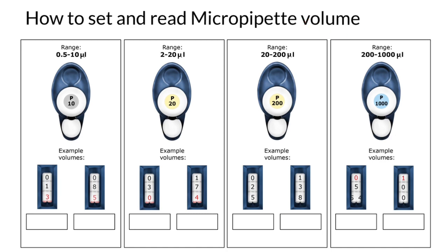You cannot take one micropipette and work with any volume you want. You have to choose the right one, the right one for your volume.